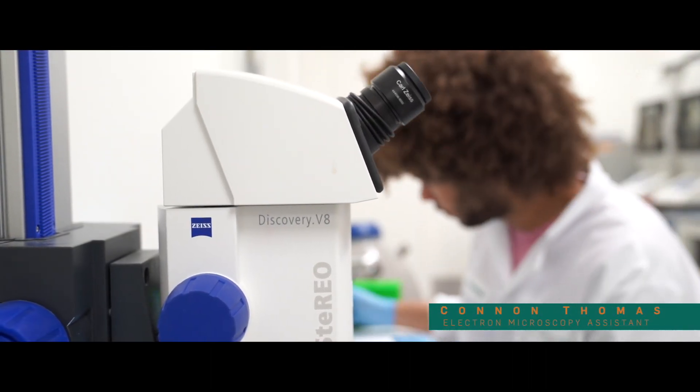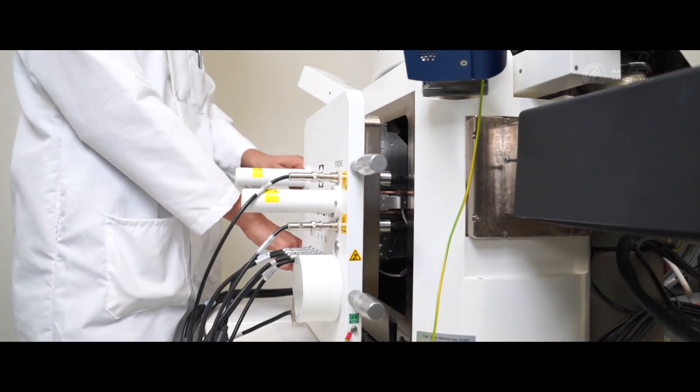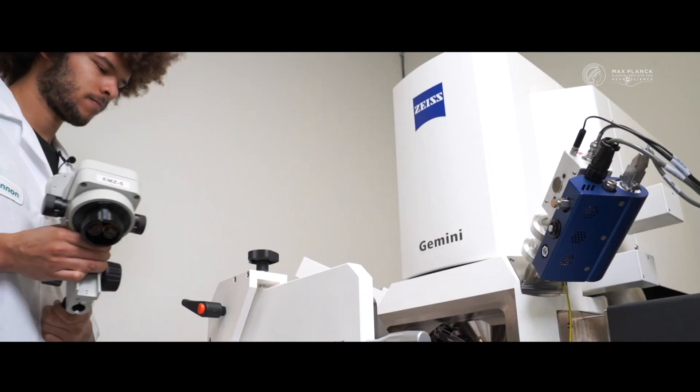Because of our partnership, we recently acquired the focal charge compensation module, which has been really huge for us.